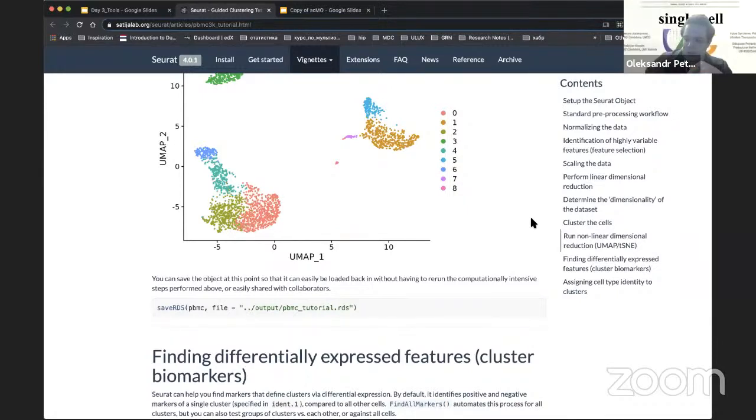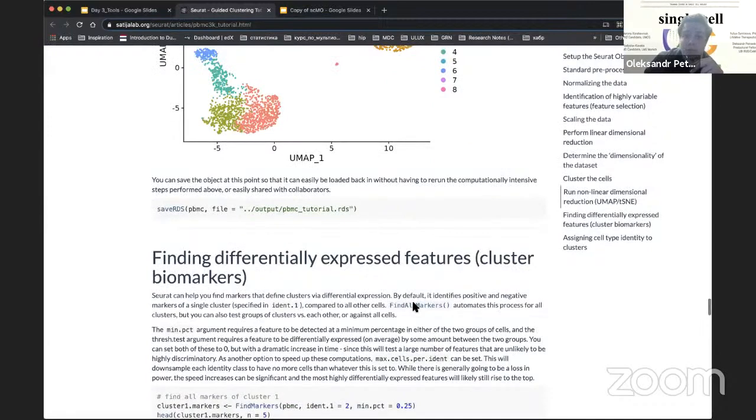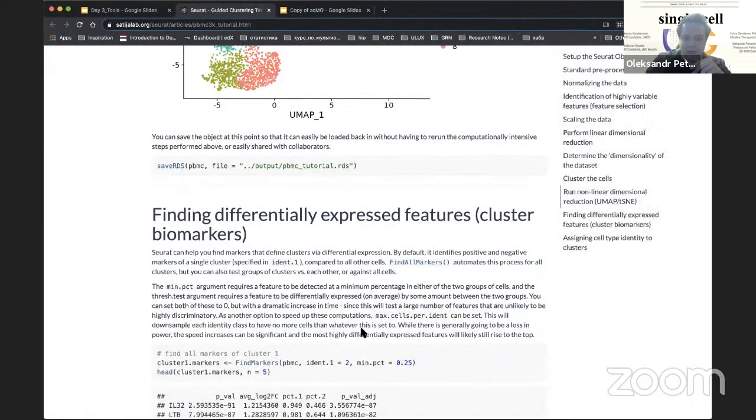Well, it's always a question about how much a marker is expressed. There could be a chance that, for example, a specific interleukin gene is expressed in one cell cluster very highly and very moderately in other cell populations. So when it's possible, I usually try to evaluate the top 10 or 20 most significant genes per cluster and see what I'm working with. That's what I usually do, just not to miss anything significant.